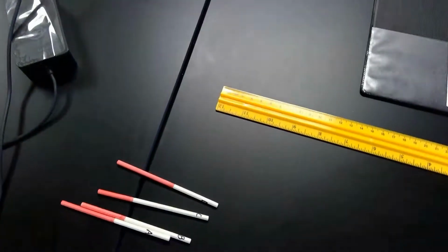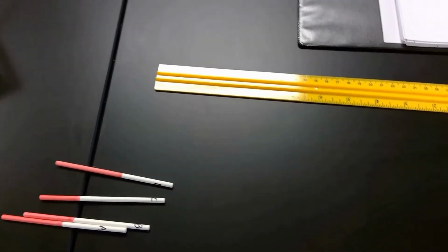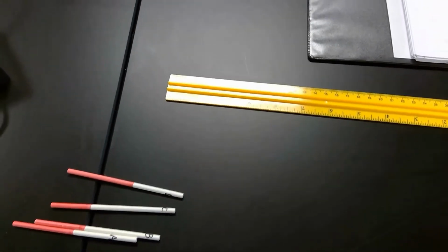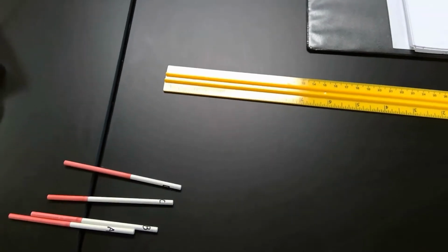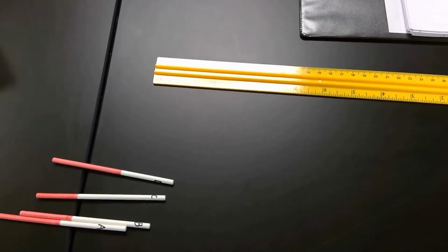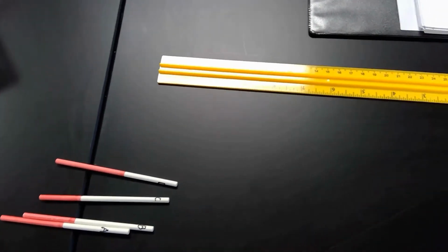And the way you do this is you get some blood and you put it in a test tube and then you spin it in a centrifuge. The red blood cells are heavy, they're the solid component. So spinning it makes that heavy part go to the bottom of the test tube. The liquid, the plasma, is lighter and it rises to the top.